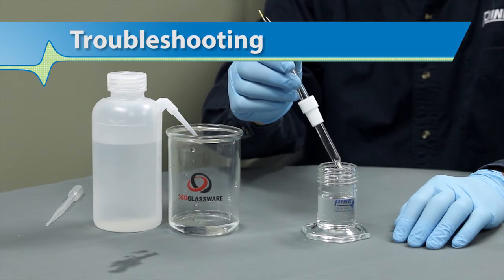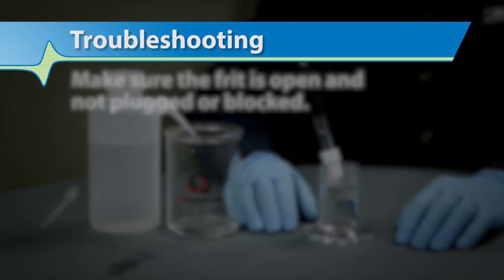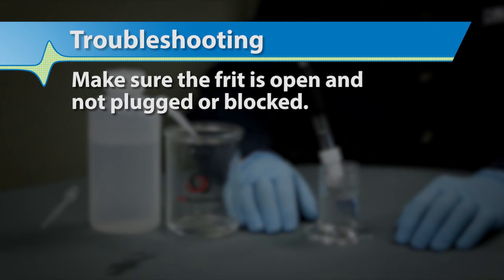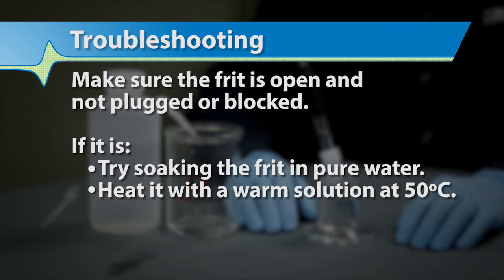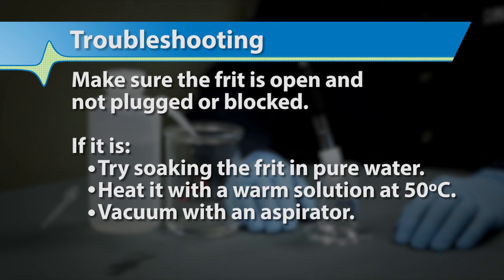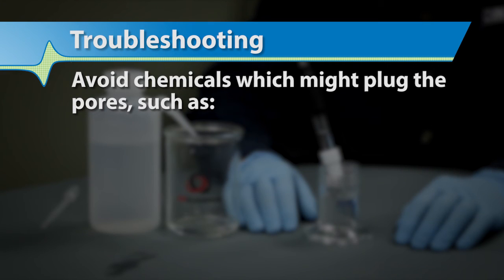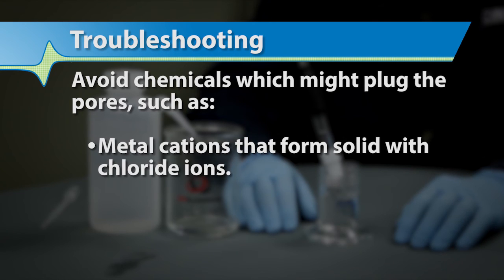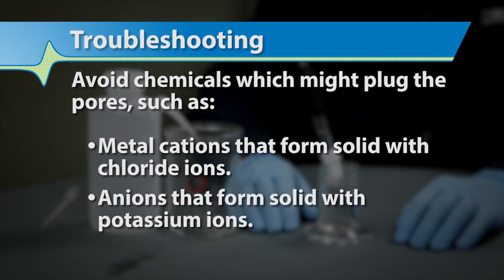Some troubleshooting things to consider if you're having issues with your reference electrode are as follows: Make sure the frit is open and not plugged or blocked. If it is, try soaking the frit in pure water. You can also heat it with a warm solution at about 50 degrees Celsius. Another option to get it unblocked is to vacuum it with an aspirator. You should also avoid any chemicals which might plug the pores, such as metal cations that form solids with chloride ions or any anions that form solids with potassium ions.